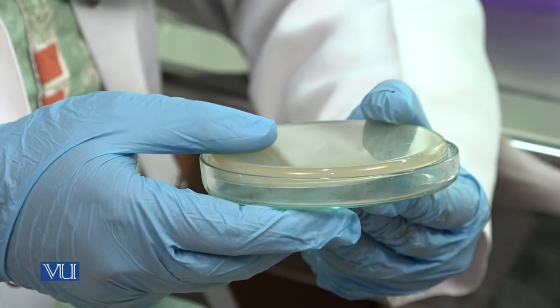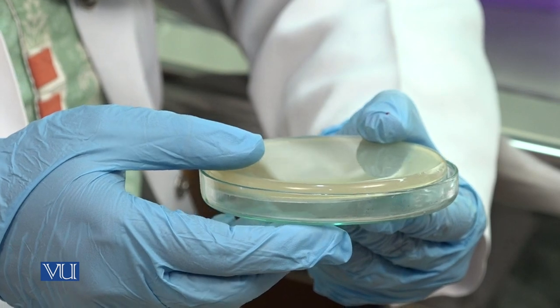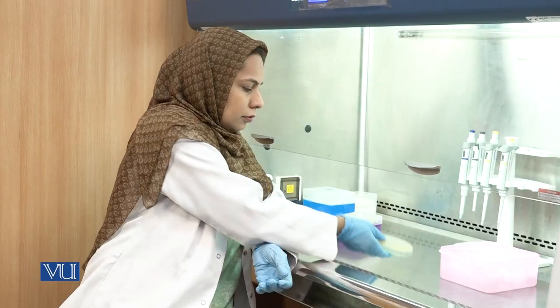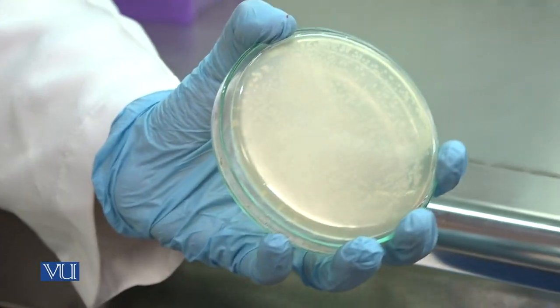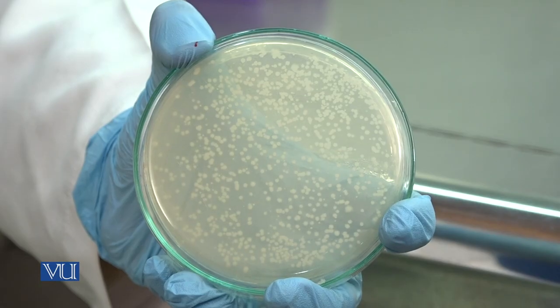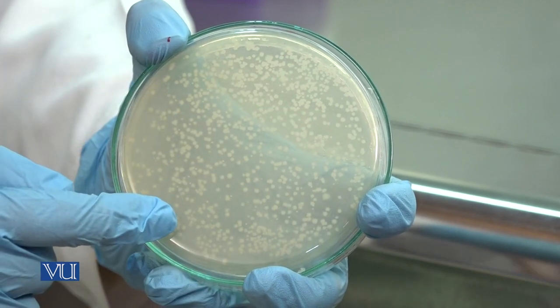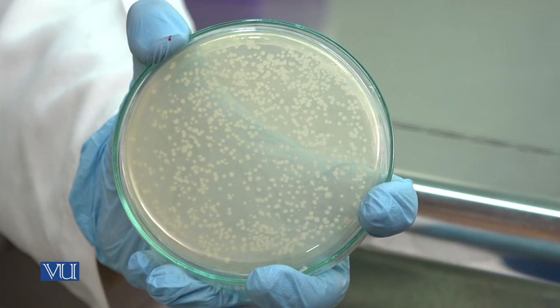After spreading of 100 microliter of culture, this plate needs to be incubated at 37 degrees centigrade overnight. And after incubation, if your plasmid has been transformed, you will see colonies. After overnight incubation of bacterial culture, your colonies will appear like this if it has transformed plasmid.